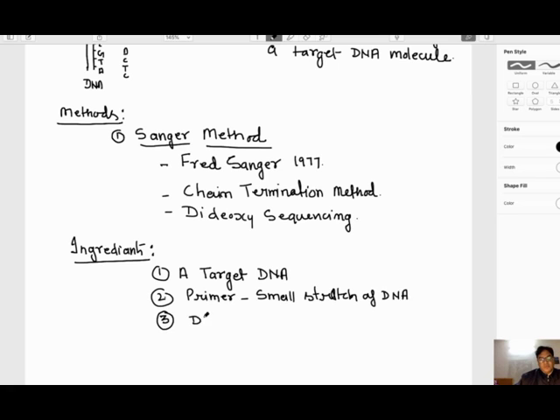We need a DNA polymerase enzyme, and we need normal nucleotides.